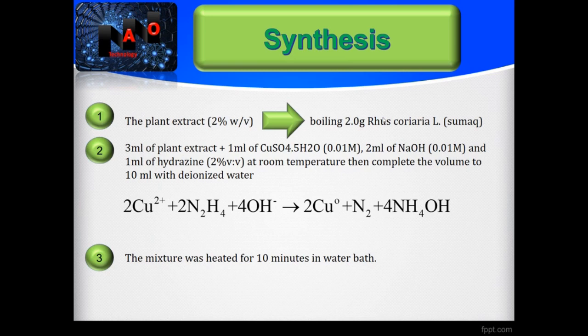2 milliliter of sodium hydroxide with the concentration of 0.01 molar and 1 milliliter of hydrazine at room temperature, then complete the volume to 10 milliliter with deionized water. You can see the reduction reaction that happened.